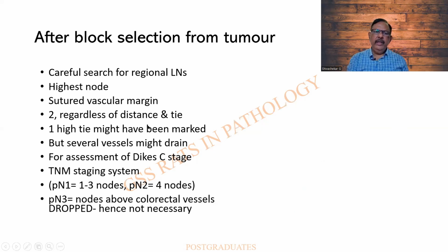So there will be the bits that will have to be given that I'll be showing you in the picture as such. So this can be for the Dukes classification, the lymph nodes, the mesentery, the lesion, etc.